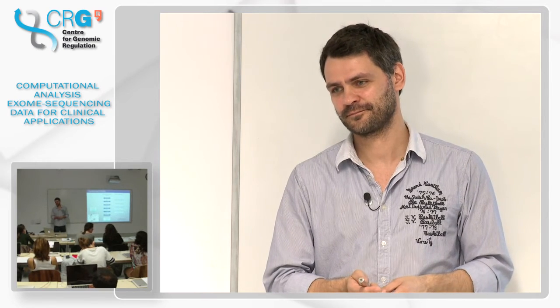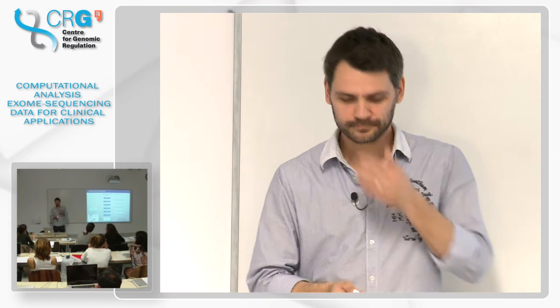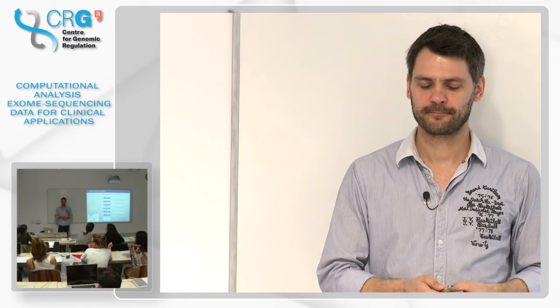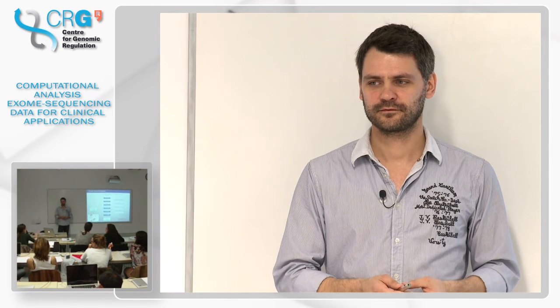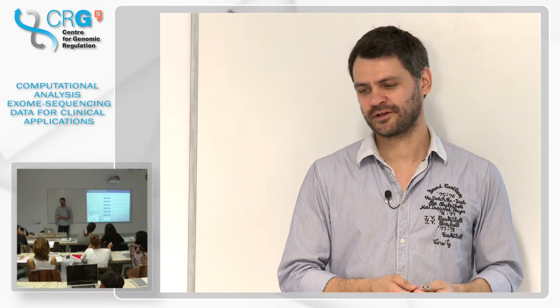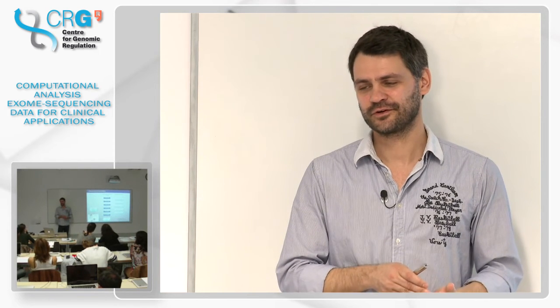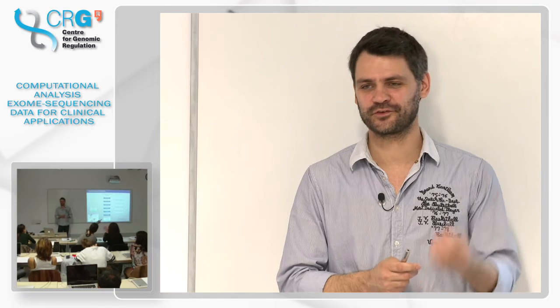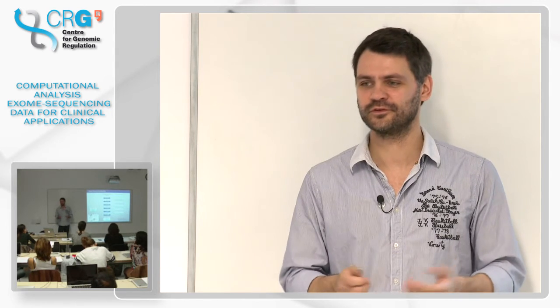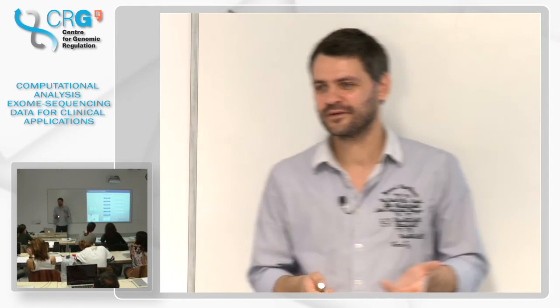But we are doing these. For example, for cancer with somatic mutations, would you recommend to have a control sample from a different tissue unaffected by this cancer from the same person? Or because now that you have so much data available, it seems that it's not important to do your own control. So for somatic mutations, we expect them to be de novo, so we expect them to not be in the population. If we predict a somatic mutation but it's actually a population SNP, we expect that it was a false positive, and we remove it. Otherwise, we do not need a control in somatic because they should be de novo and random.